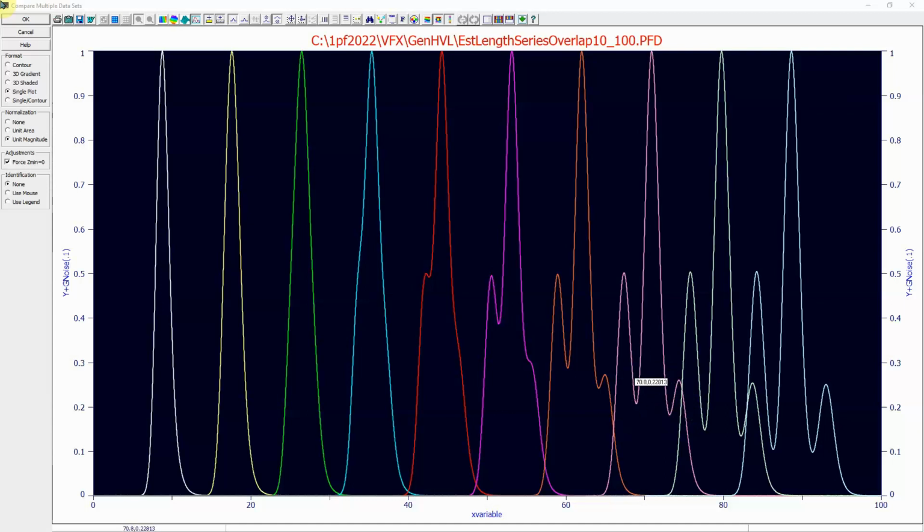In this data here, you see the 80 millimeter column length meets that requirement. From here on out we would see very high accuracy if we fit all of the individual parameters separately. If we do not, our rule of thumb has been that if you can find the individual peaks with a second derivative hidden peak method, as far as their placement goes, you would likely see a good measure of accuracy in the fitting. It just requires you to share the A3 chromatographic distortion, and depending on how much separation there is between the components, you may also need to fit a common width.